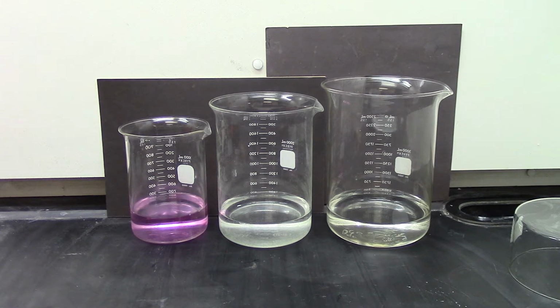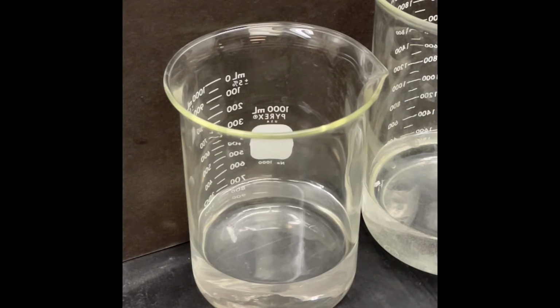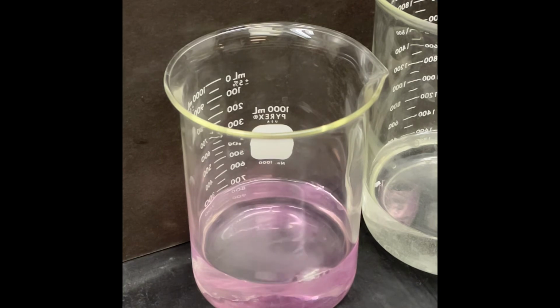Let's watch this reaction again from a slightly different angle. You might notice that while this reaction is vigorous, it's a little bit slow. The reactivity of alkali metals increases as you move down the column, a periodic trend.